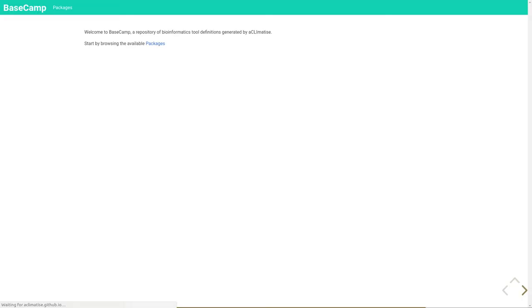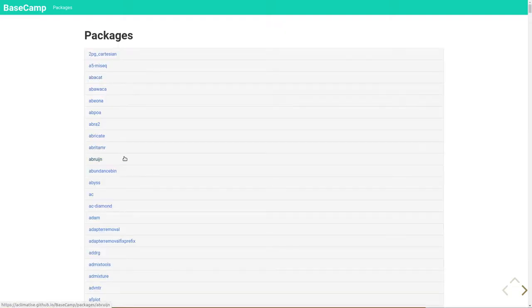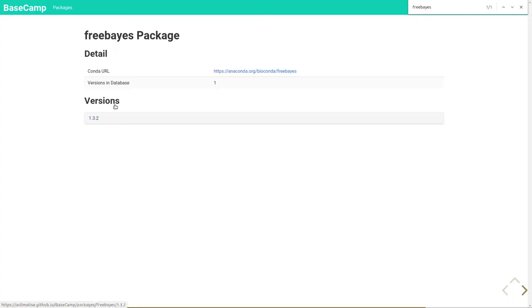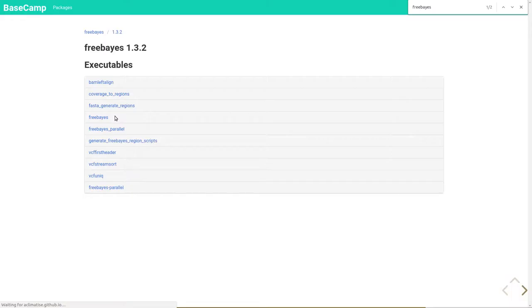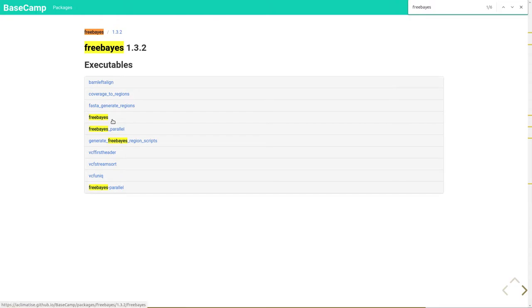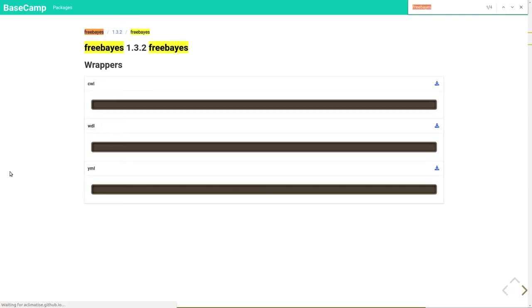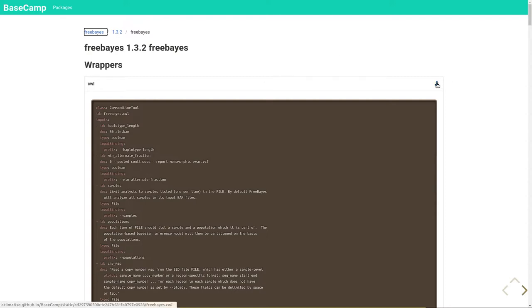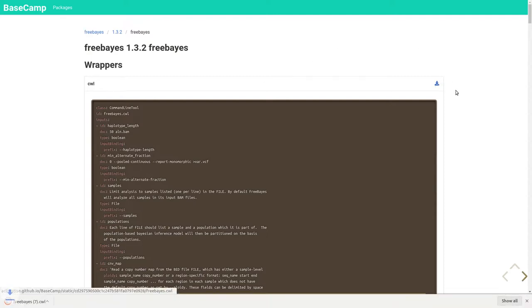Here, I'll demonstrate using Basecamp to download a tool definition for the freebayes variant caller. On this page, you can see nearly 8,000 Bioconda packages that have been converted. Within each package is a list of versions that have been converted. Within this is a list of each executable file within the package. And finally, on this page is a list of tool definitions in the different workflow formats. You can easily download one of these using the download button and integrate them into a portable workflow.